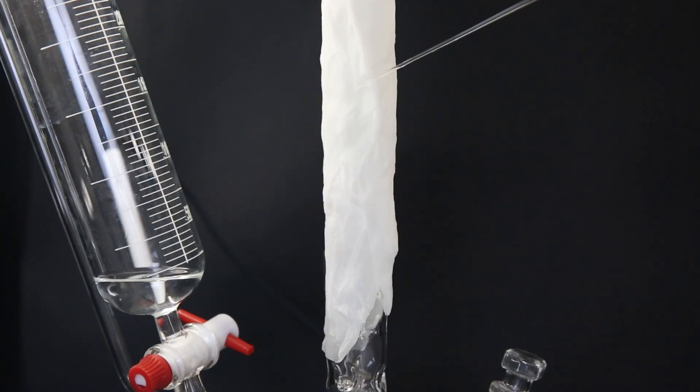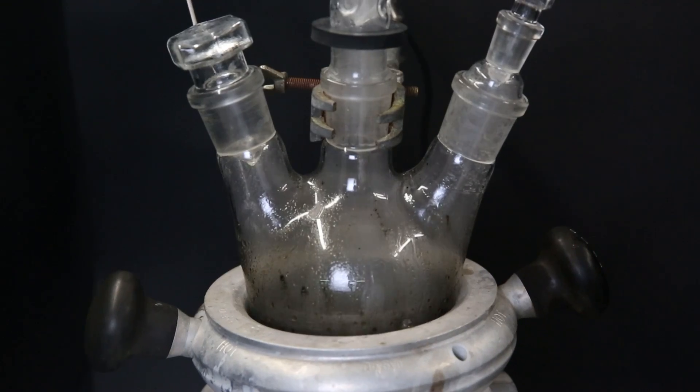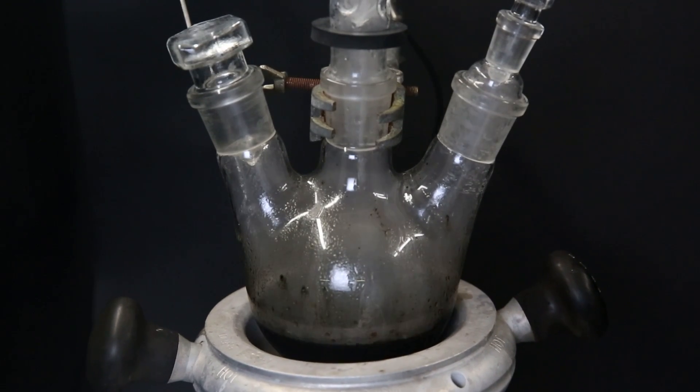Instead, I opted to wrap part of the column in paper towels and soak them in water. This turned out to be effective and the thermometer started showing around the boiling point of diethyl ether. After doing this, I let it continue for a while and stopped the distillation when pretty much nothing more came over. So I removed the heat source and stopped the distillation.